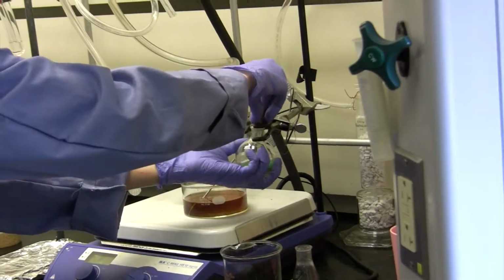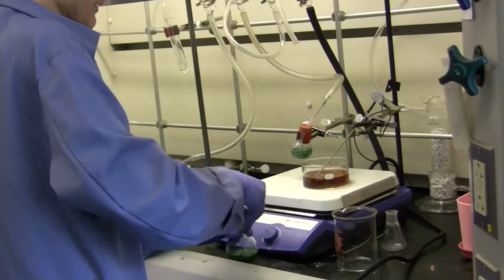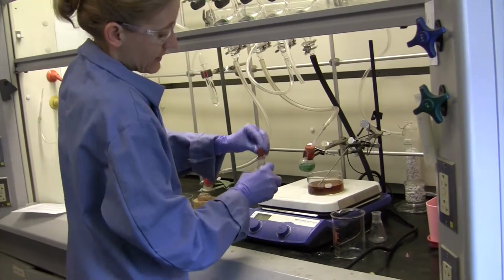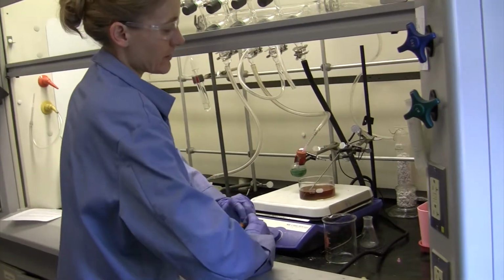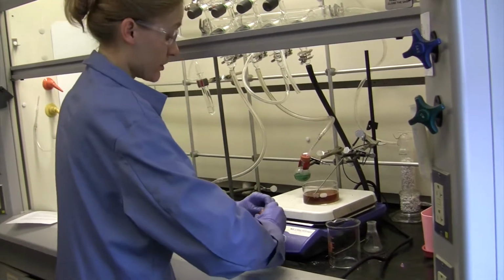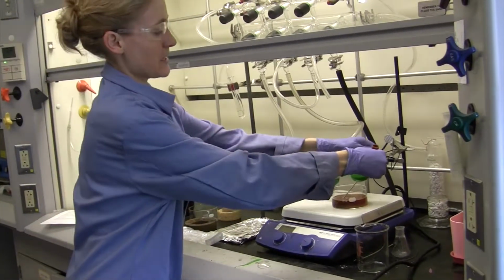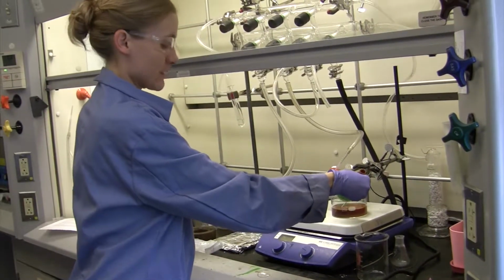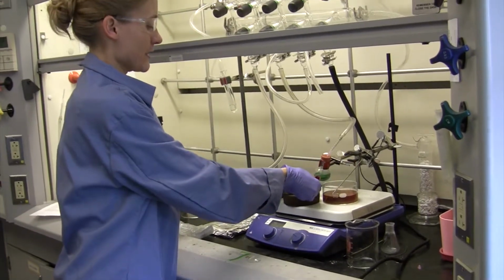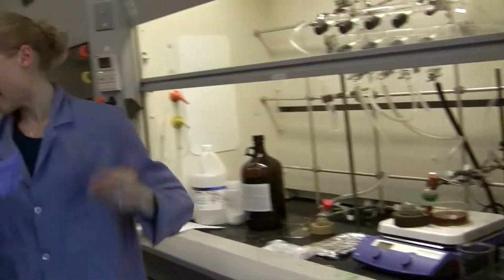So as I mentioned, chloroform is carcinogenic. So if you get a little bit on your gloves, you do want to change your gloves as quickly as you can. So what I'm doing right now, I'm putting the stopper back in, because we're just going to let this stir for just a few minutes to make sure everything is dissolved. We will hurry up our stirring by using a little bit of swirling like this. Put this here. And I did get a small amount of chloroform on my gloves, so I'm going to change my gloves.